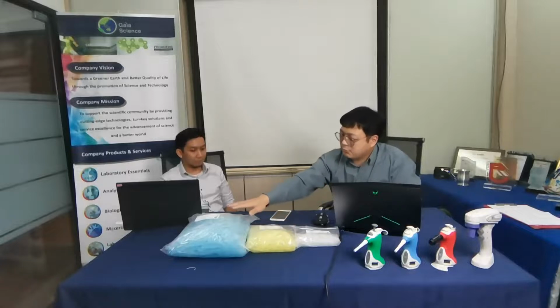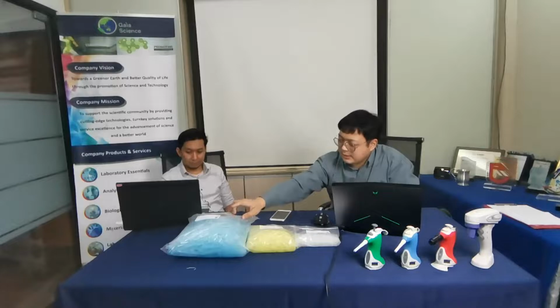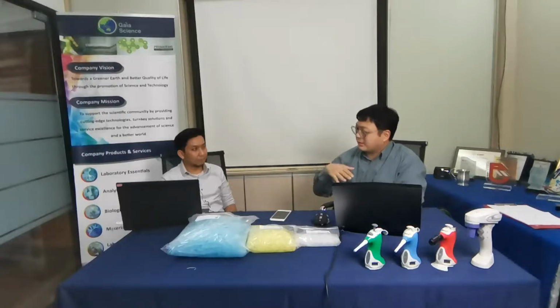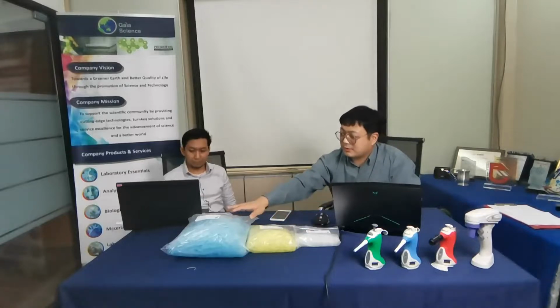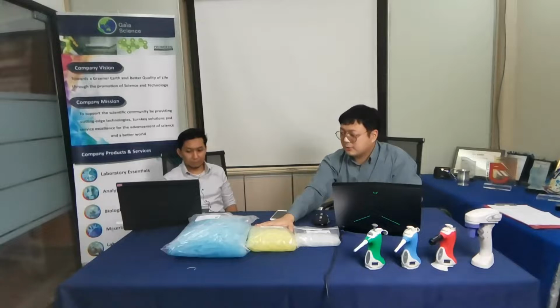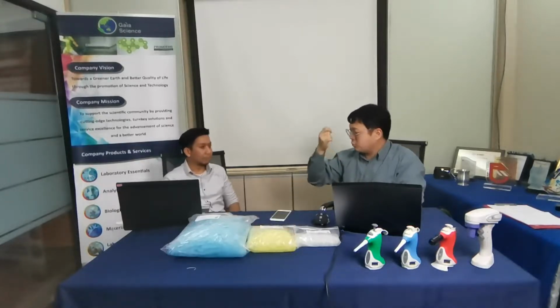And the last one, the blue one, is for 1000. Sometimes for the blue ones, there's also 1250, which is for some of the pipettes that can take more. So just bear that in mind. Although they say 10, 200, and 1000, as you can see here from our Gaia Science logo brand, the actual amount that the tip can take is a little bit more, just in case the liquid goes up too close to your pipette itself.